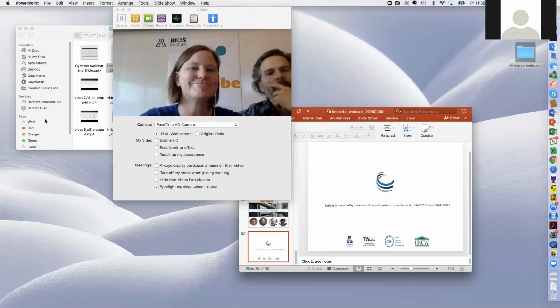So you could use certain apps like our MASH all versus all, or RepSeq MASH, and then the Libra algorithm could tell you, for instance, how similar your data sets are to the data sets that we have curated in iMicrobe. So if you have insect-associated metagenomes, you could put it into iMicrobe and then compare it to what we have. Or you could just simply run our tools.